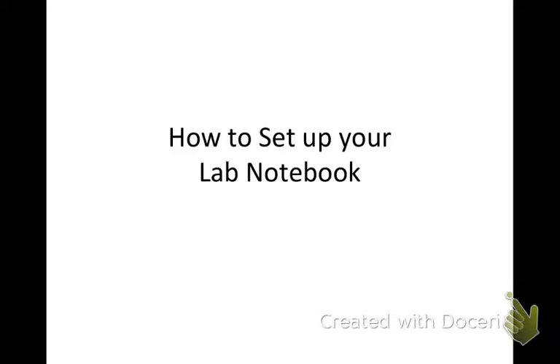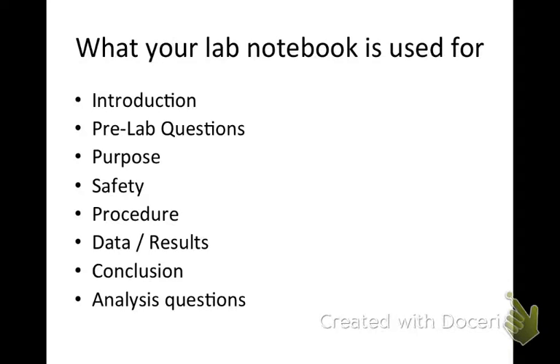Everyone, so here in this video we want to talk about how to set up your lab notebook. So your lab notebook is used for introduction, pre-lab questions, the purpose, safety, procedures, any data results, conclusion, and analysis questions. Now these will all be subheadings in your lab notebook, so make sure that they're kind of obvious. So like if I'm looking at your notebook or if someone else is looking at your notebook, we should be able to see exactly where the purpose is.